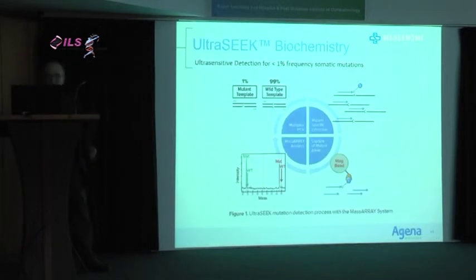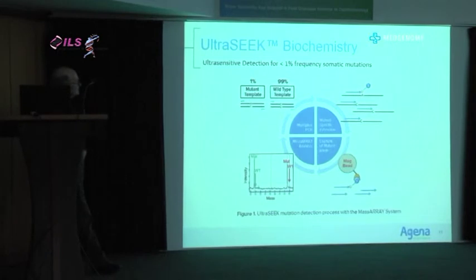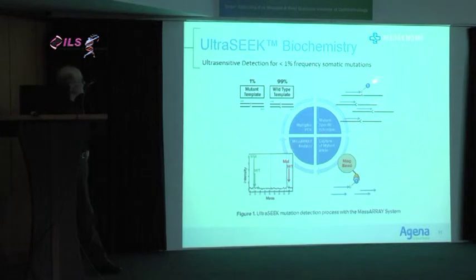This is the trick that we use to pump up the sensitivity of the DNA mass spectrometry so that we can see very low levels of mutant sequences. We're not interested in the wild type allele. We know it already, so why bother to detect it? What we do is leave out the polymerase substrate that allows a primer to be extended on the wild type template, so we eliminate that extension product altogether. We cycle the sequencing reaction until in one cycle a primer sits down on the rare mutant template, however rare it is, and is extended by a single base and stops. So with a trick like this, we can force the detection of any molecules of mutant template, so long as the polymerase doesn't misincorporate.